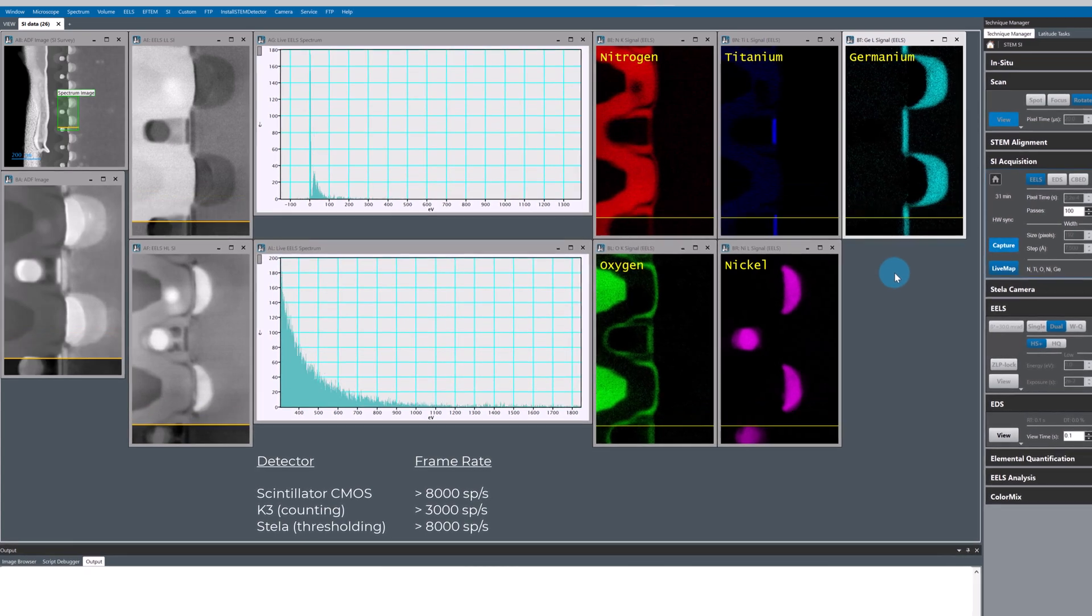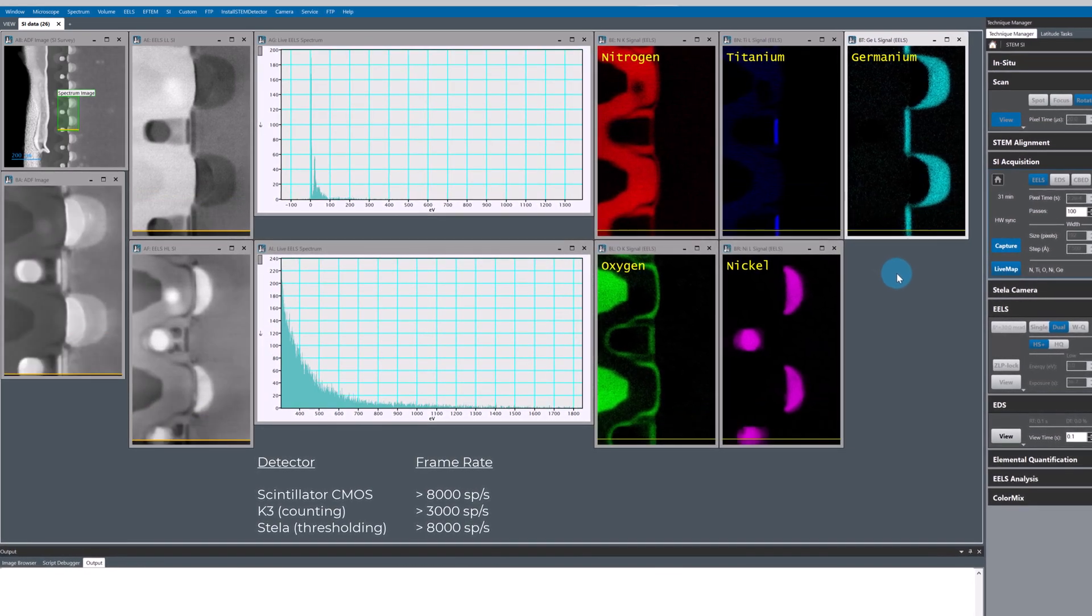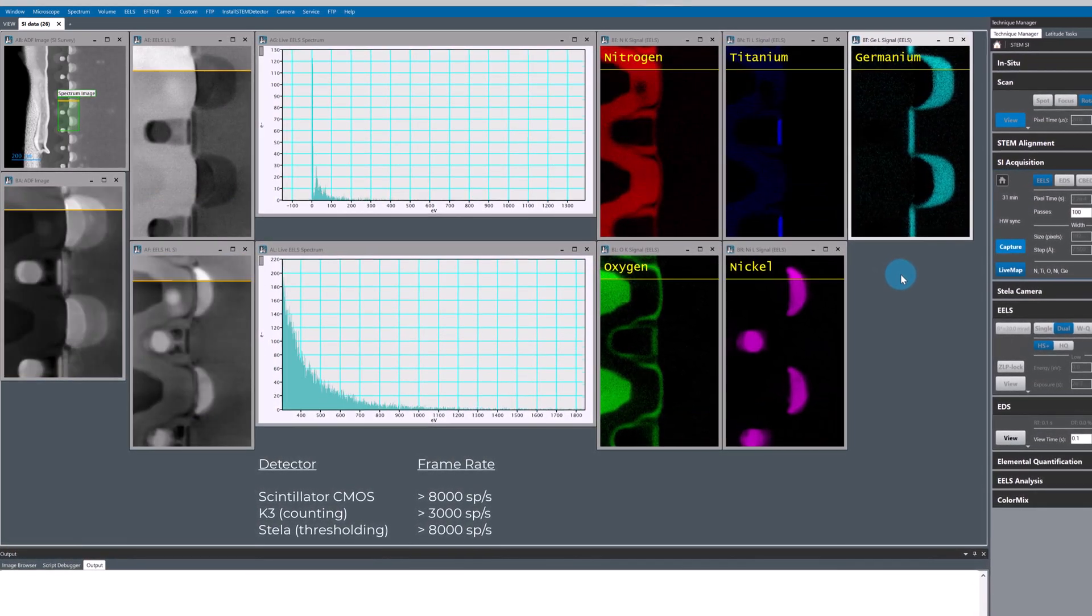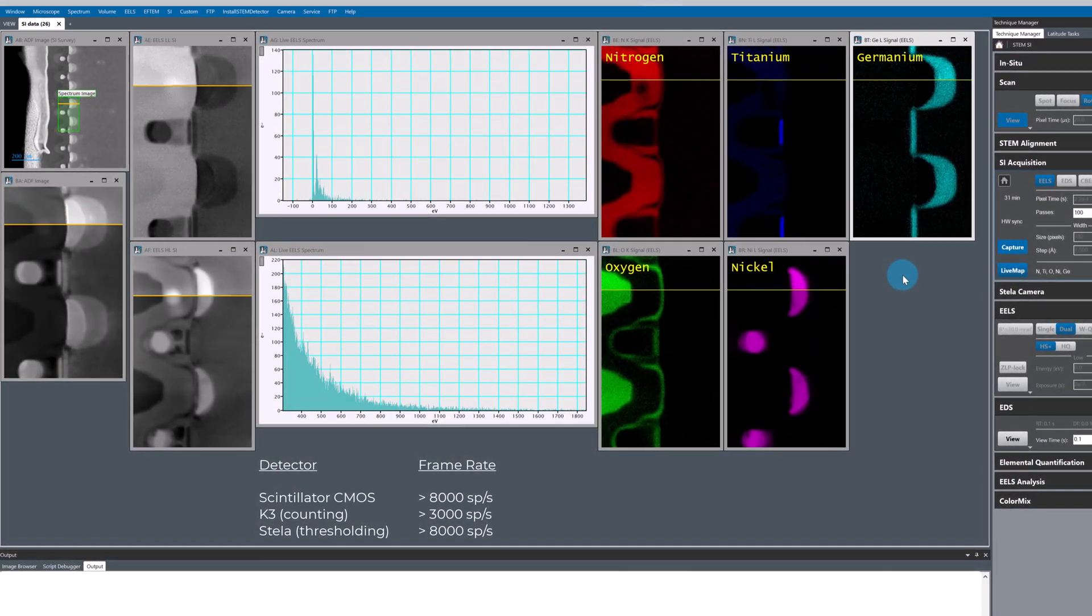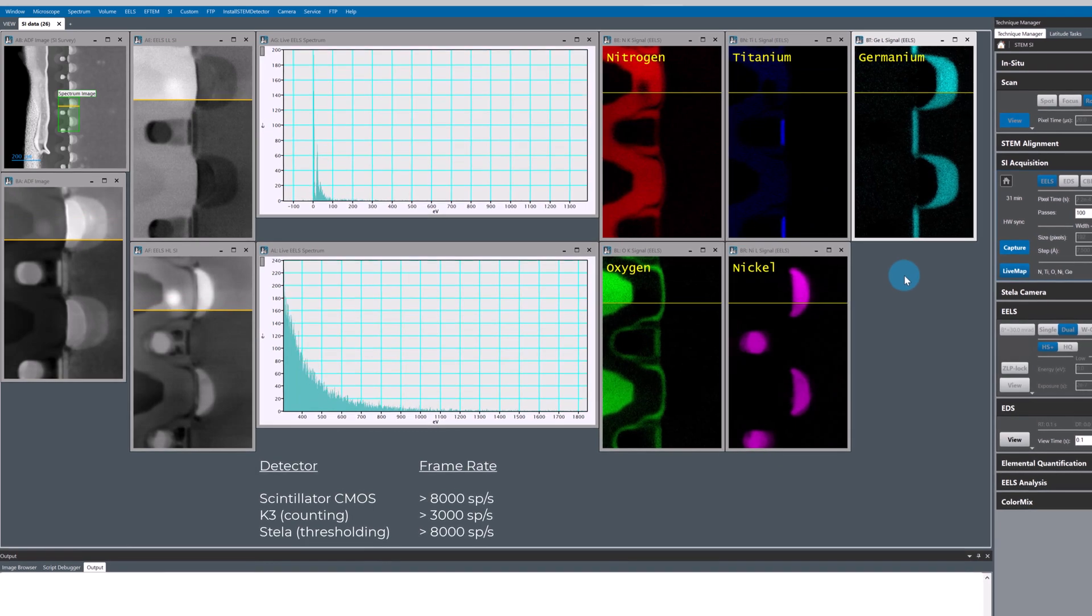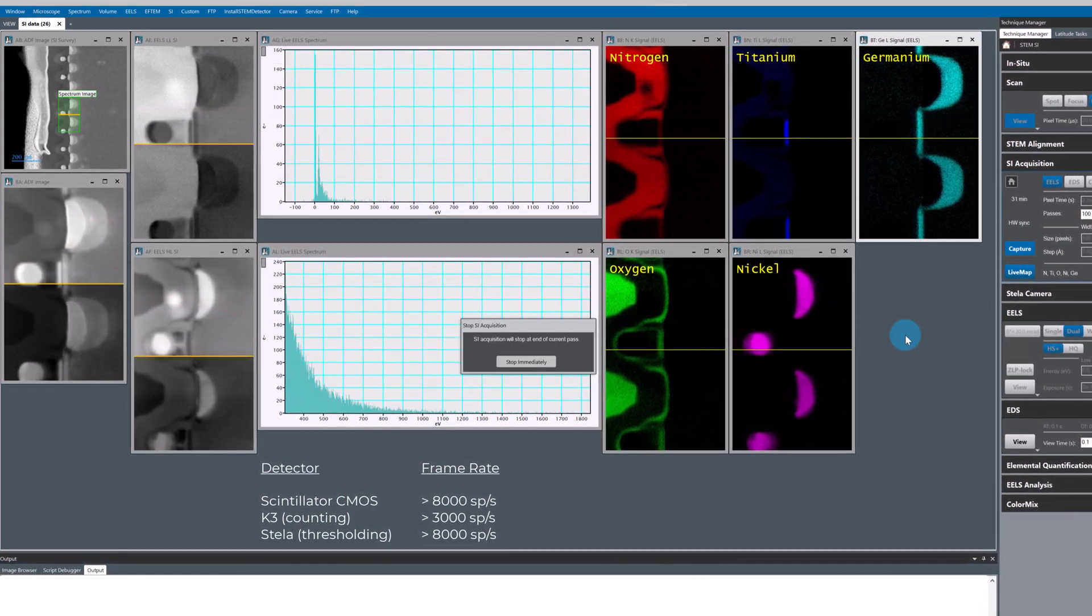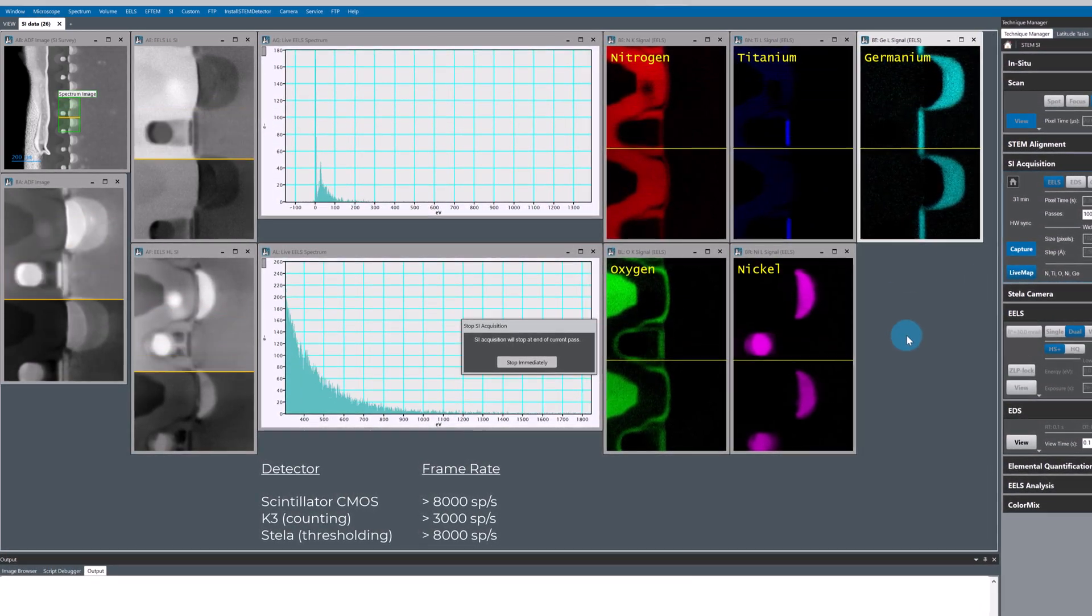When I'm happy with the data, I just click capture again. The capture will stop when the current scan is complete and I'm good to get on with the next part of my experiment.